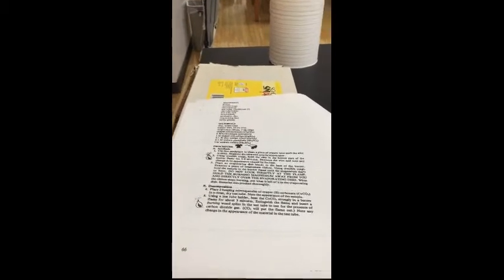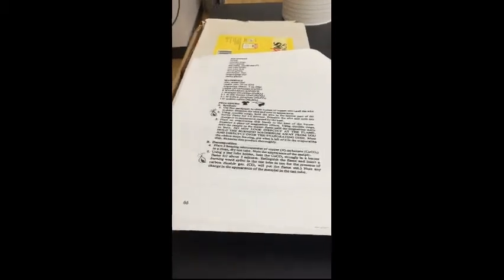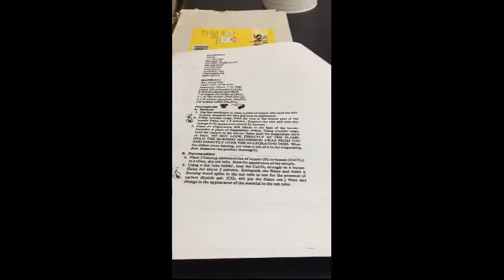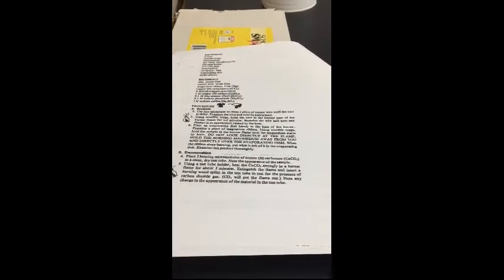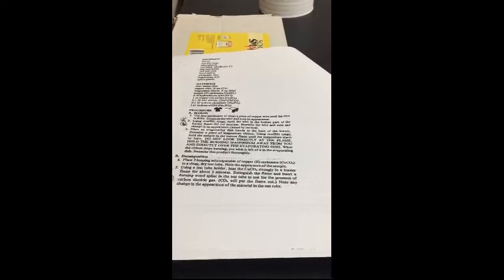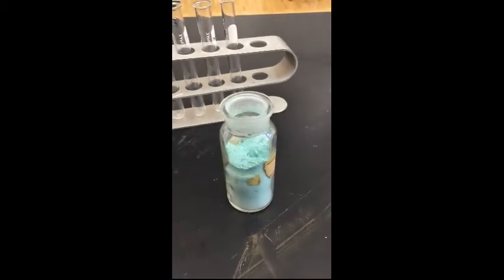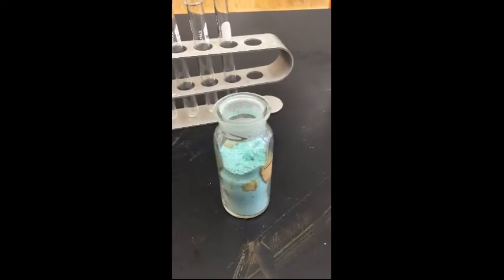Okay, for the decomposition part of this lab, it says place 2 heaping microspatulas of copper 2 carbonate in a clean, dry test tube. Note the appearance of the sample. So I'm not going to use 2 heaping spatulas full.